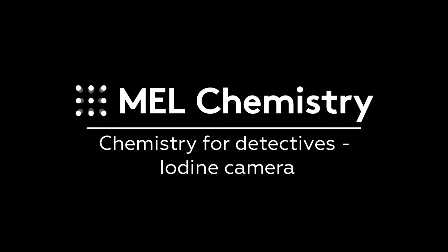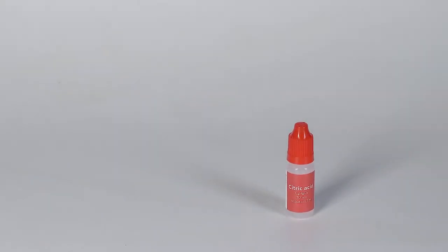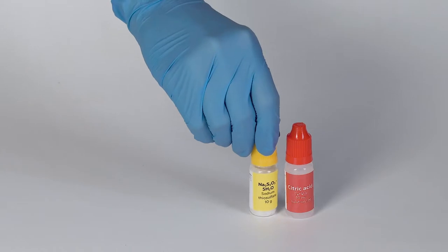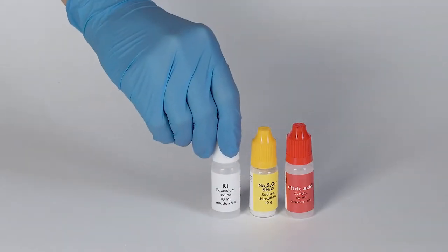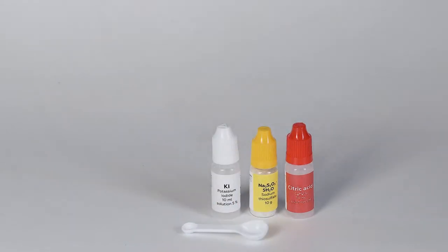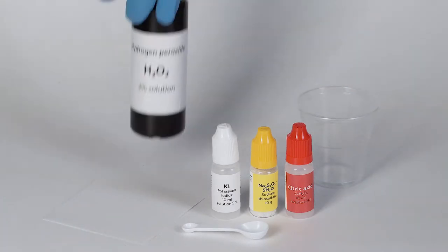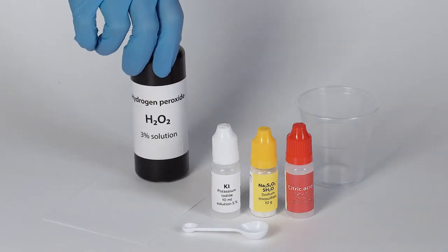For the iodine camera experiment, you will need the solution of citric acid, sodium thiosulfate, the solution of potassium iodide, a measuring spoon, a white sheet of paper, a disposable cup, and 3% hydrogen peroxide solution.